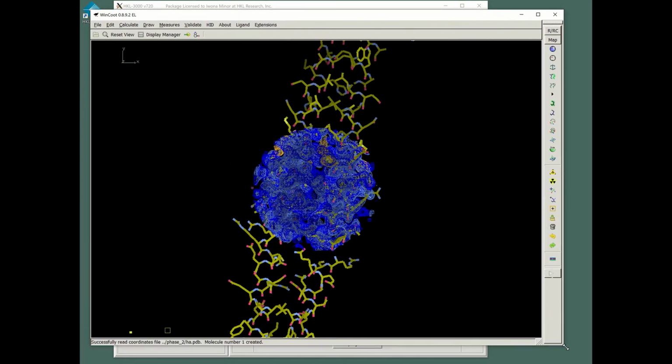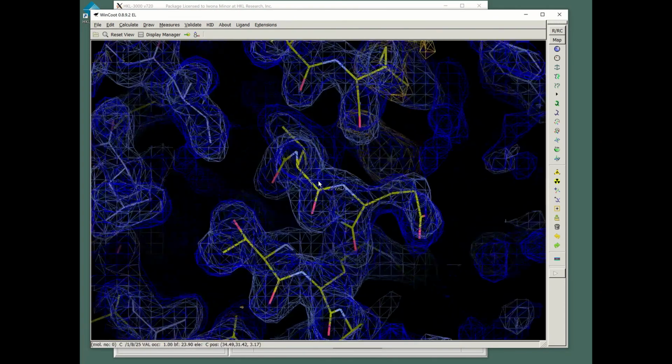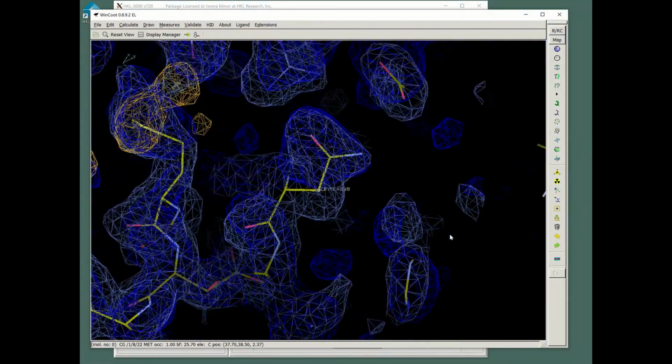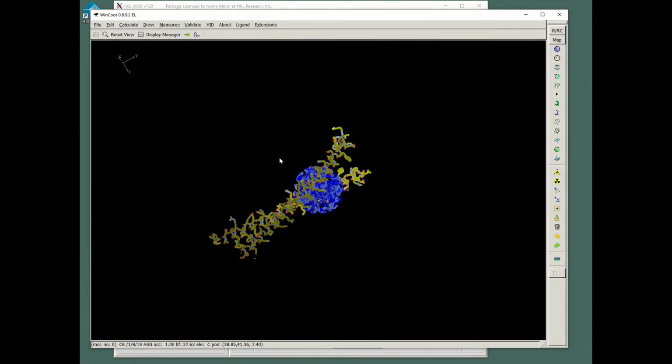Once building is complete, another session of Coot will open. This time, in addition to the substructure solution, anomalous difference maps, and the density modified map, hopefully you will also see a fairly complete model and the refined 2FO-FC map.